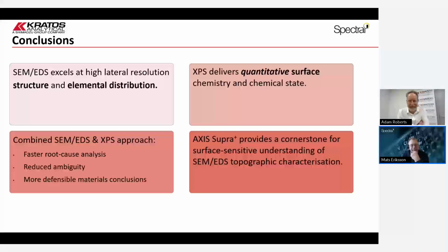I also added a question in the beginning, just as a backup, about using EDS for thin film measurements. And there was also one of the comments that you could use EDS or EPMA, which of course is electron probe microanalysis. So SEM EDS, but in a more dedicated format. Of course you can vary the acceleration voltage and look at the different penetration depths, and then make a model to calculate film thickness with EDS as well.